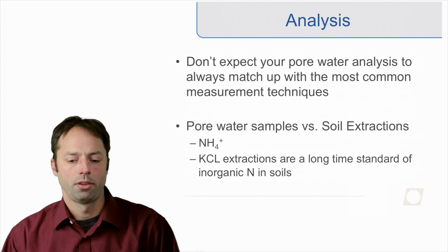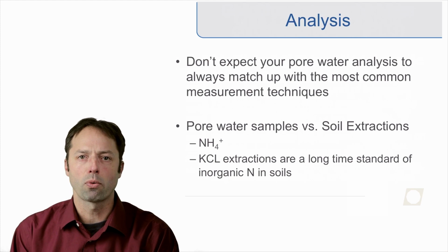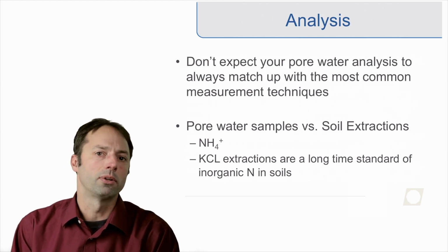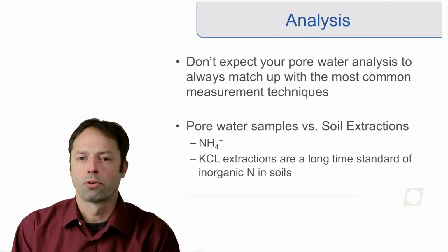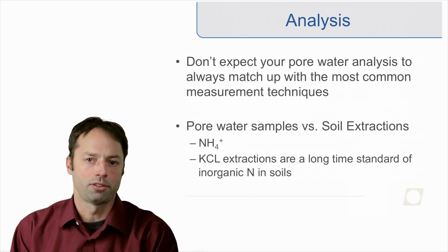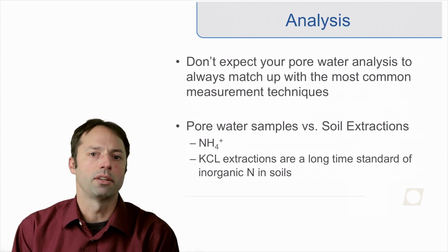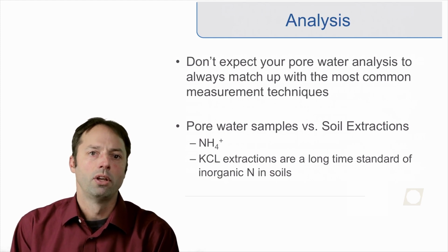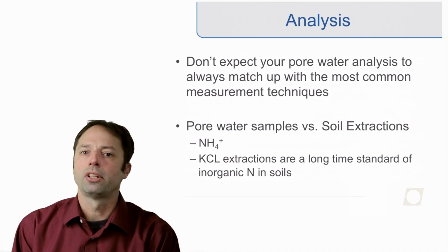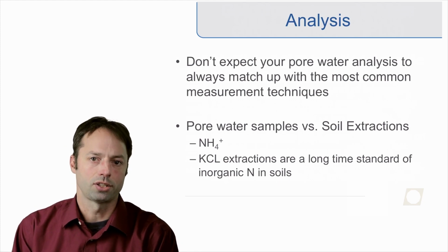So now there's this question: your pore water analysis isn't always going to match up with the most common measurement techniques. I'm going to use one example for ammonium. It's been very common that ammonium has been analyzed through KCl extractions in the soil. That creates a much different environment than just sampling the pore water sample. So be aware that using some of these methods, you won't necessarily get the exact same data as the historical data from KCl extractions.